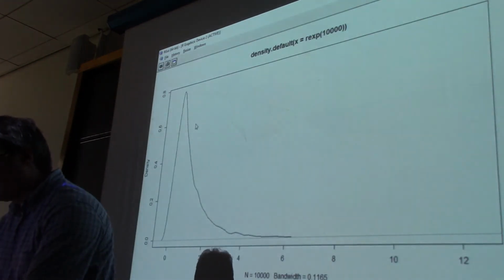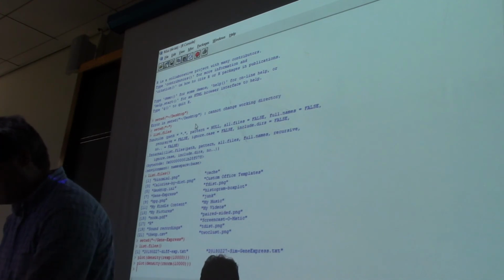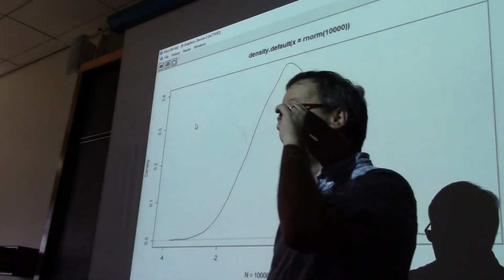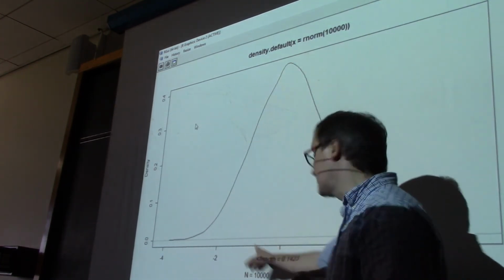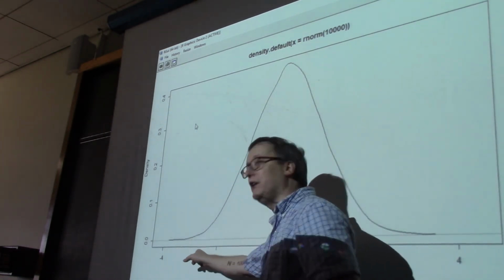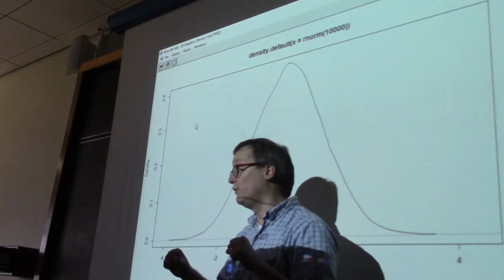Well, we plotted the other just a moment ago, so let's clear that away and pop over here. I'm going to say plot density rnorm 10,000. That is a normal distribution. So the software was deciding how different these fold changes would be by drawing from this distribution. And it's doing it on a log fold change as well. So it might accidentally get a value that's extremely towards yellow, or extremely towards red. But most of those fold changes are going to be quite small.